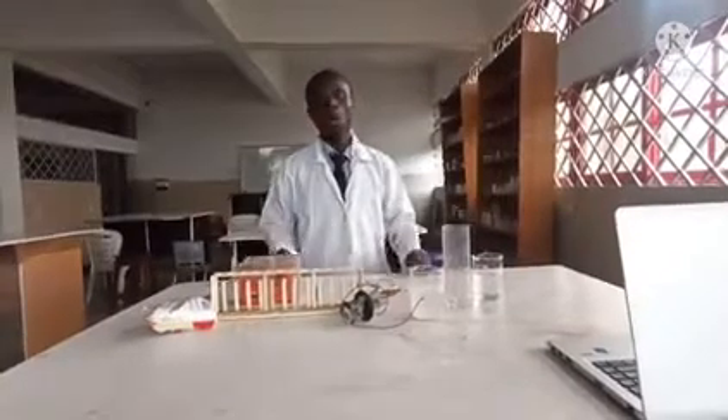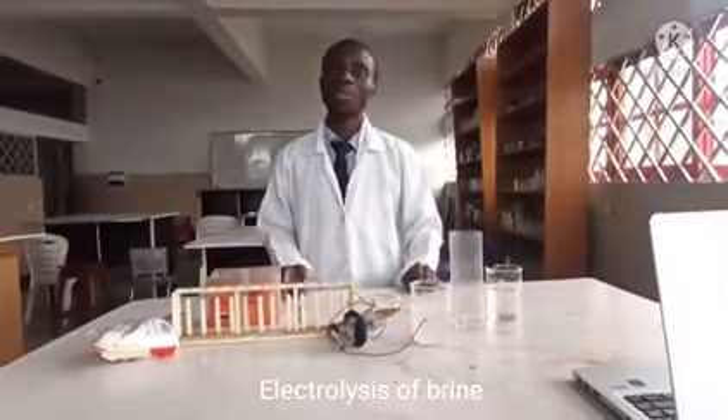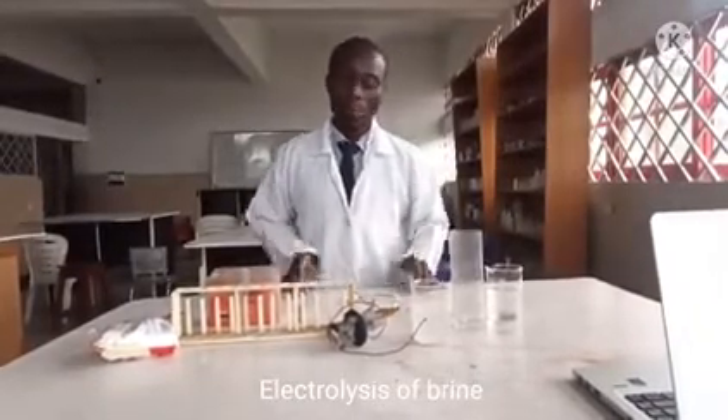Today's presentation will be on electrolysis of brine, where I'll be producing chlorine. I'll also be producing hydrogen and I'll also be testing both elements.